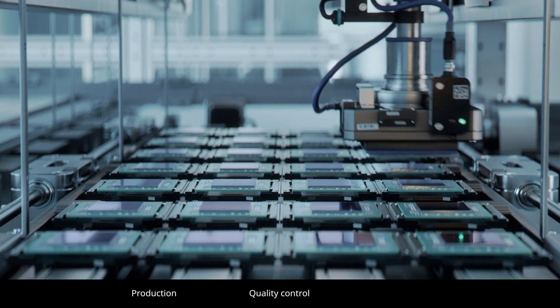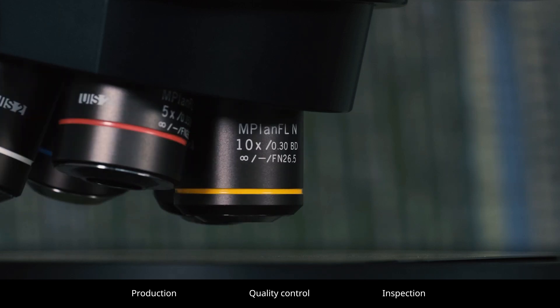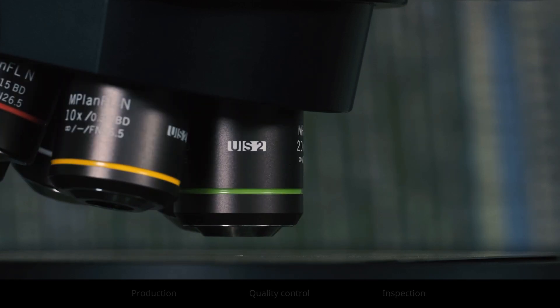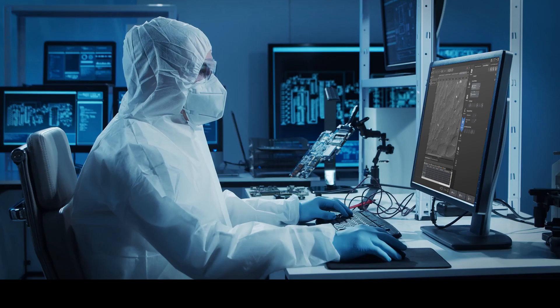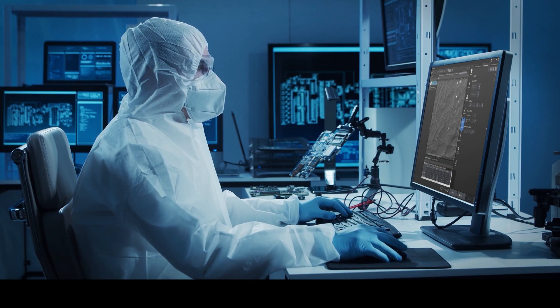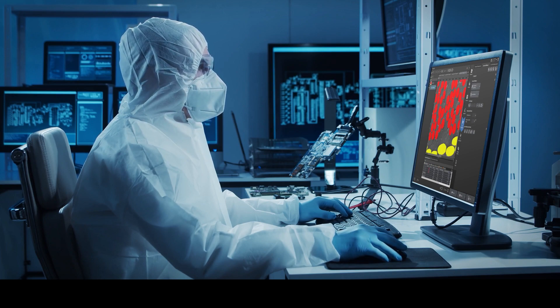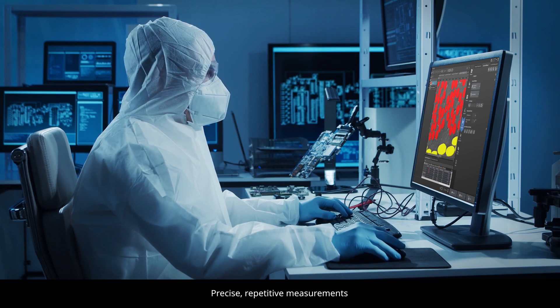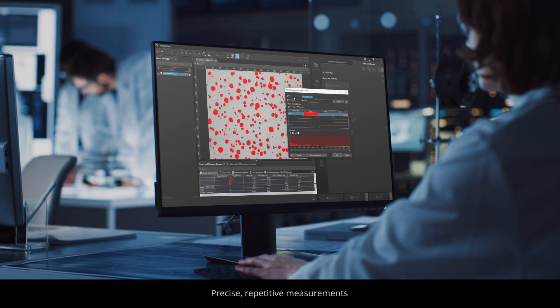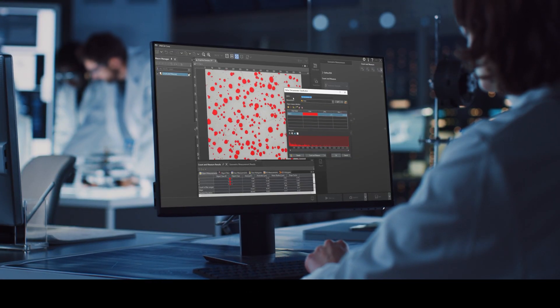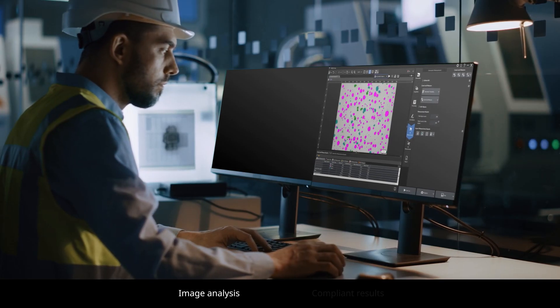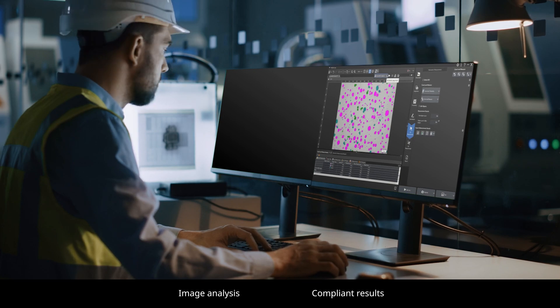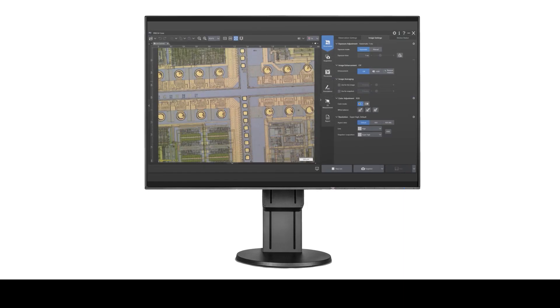Designed for production quality control and any inspection application that uses an automated or manual microscope, impressive image analysis software makes it easy to perform precise, repetitive measurements or conduct reproducible complex image analysis and obtain results that comply with international standards.